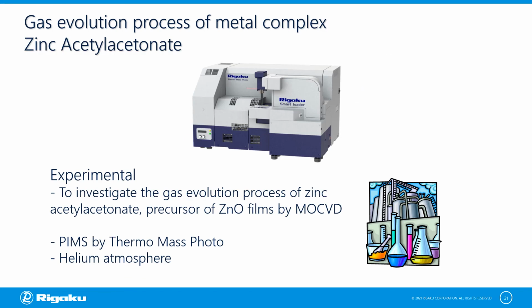In our next application, the gas evolution process of zinc acetylacetonate is evaluated using the photoionization mode in STAMS under helium atmosphere.